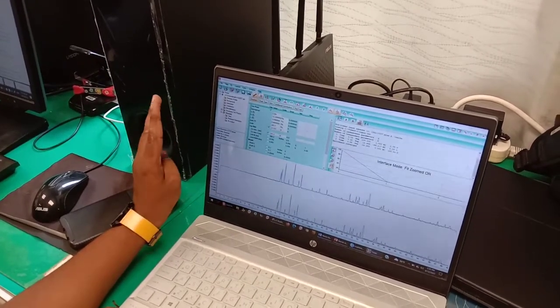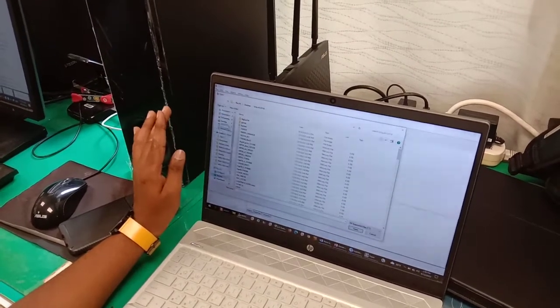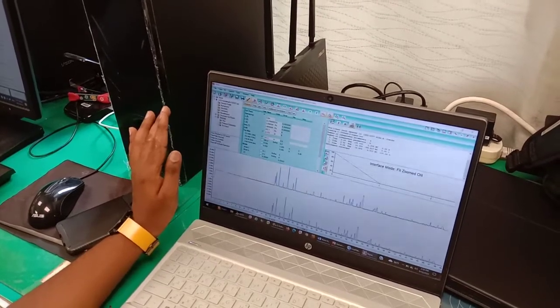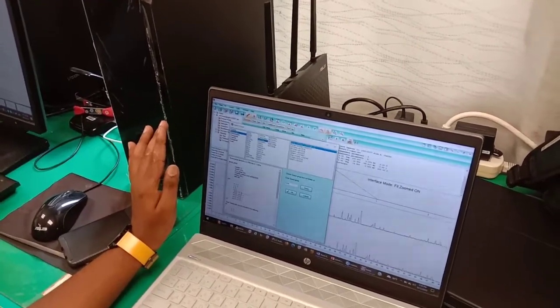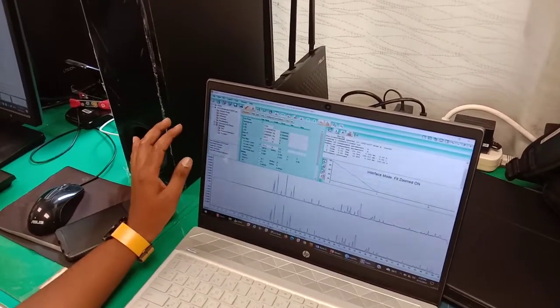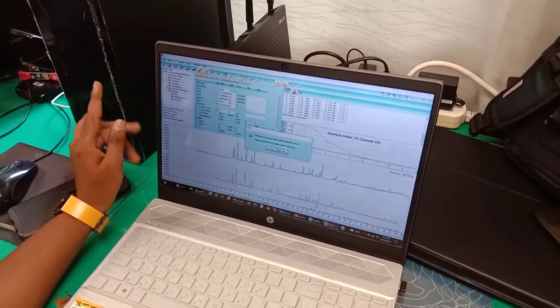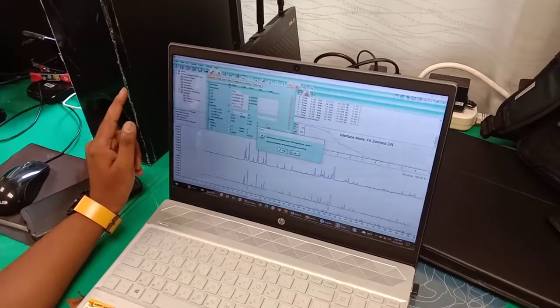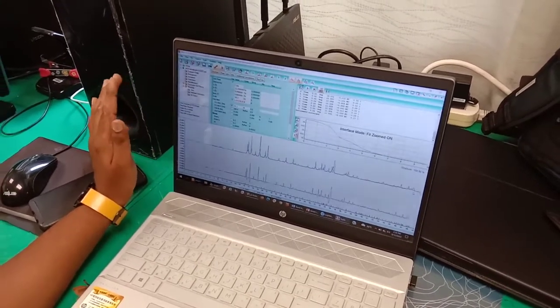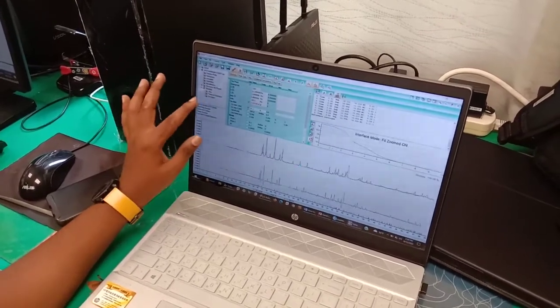Maybe I will check it. C12M1. Are you sure? Yes. Number 12, right? Yes. Okay, sure. So just choose the file and you just run it. So now you can see before it was 14, right? And now it's like 11. And also we can see something has started to fit, which means we are choosing somewhat of a good CIF file. So this is the first iteration, right?